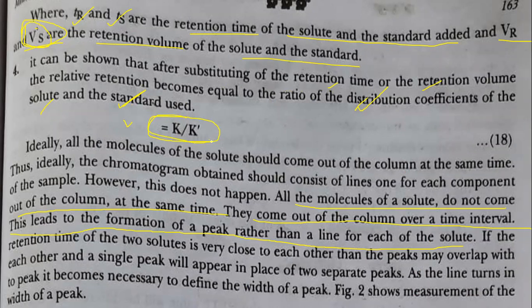So all molecules of solute do not come out of the column at the same time. So there may be the formation of a band.